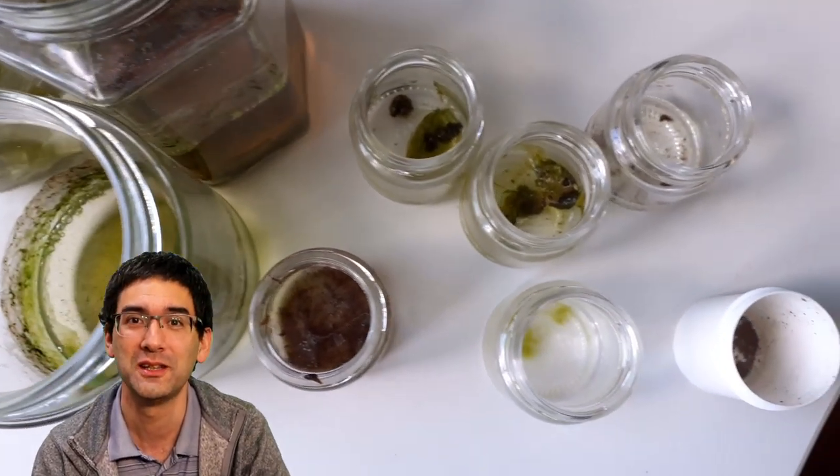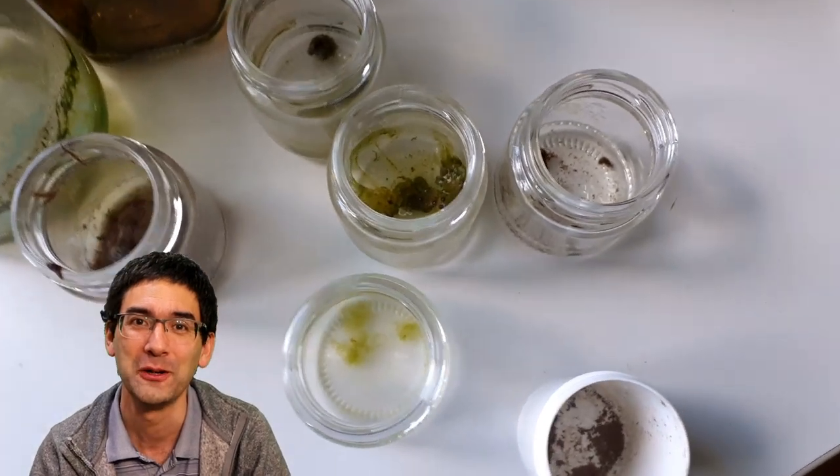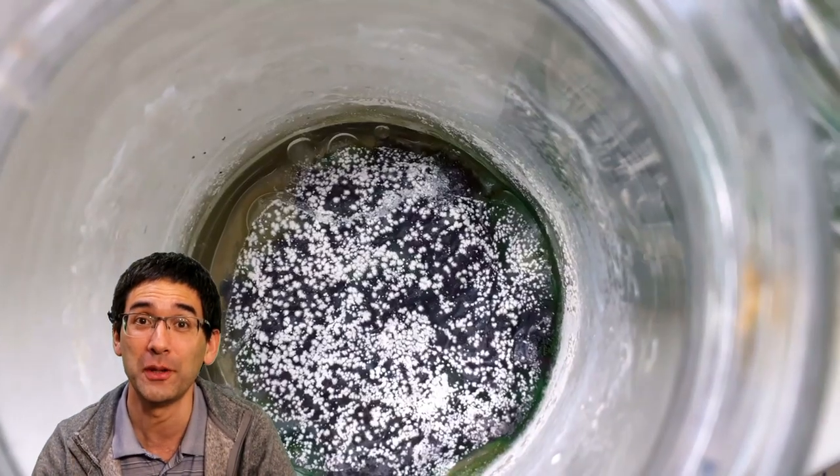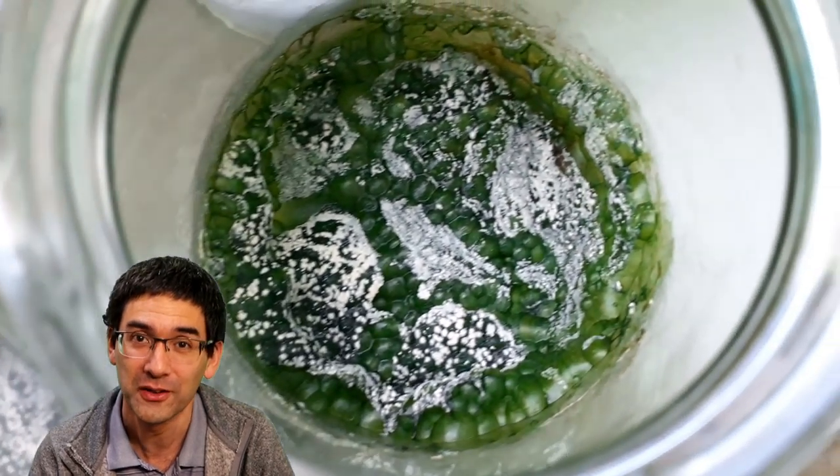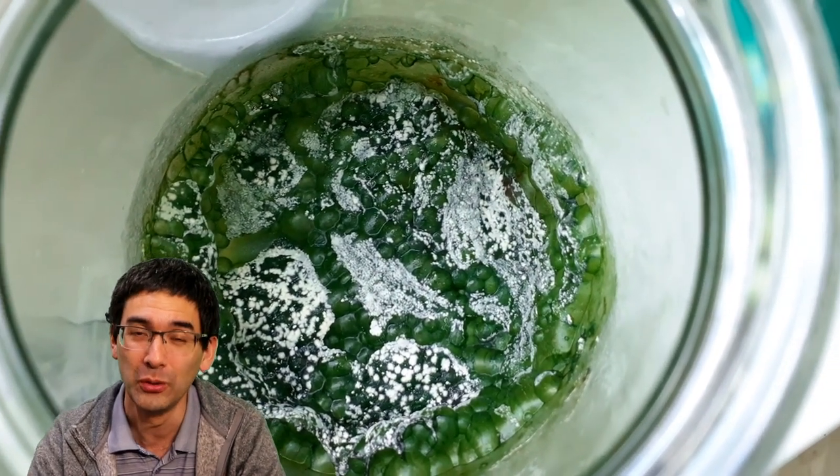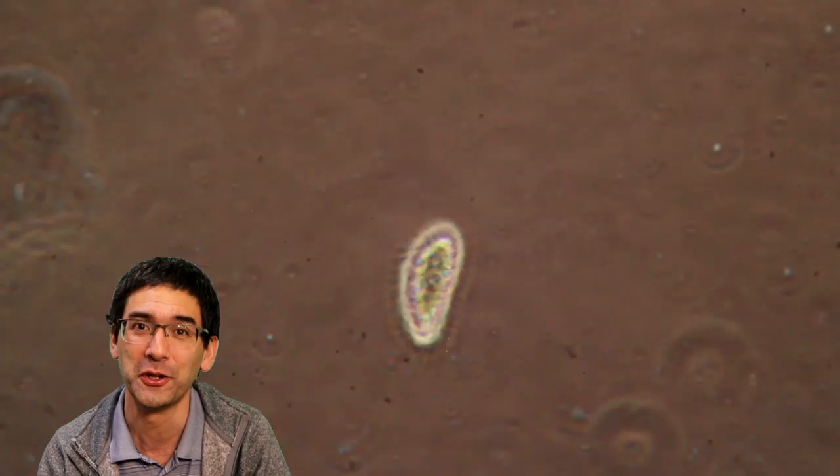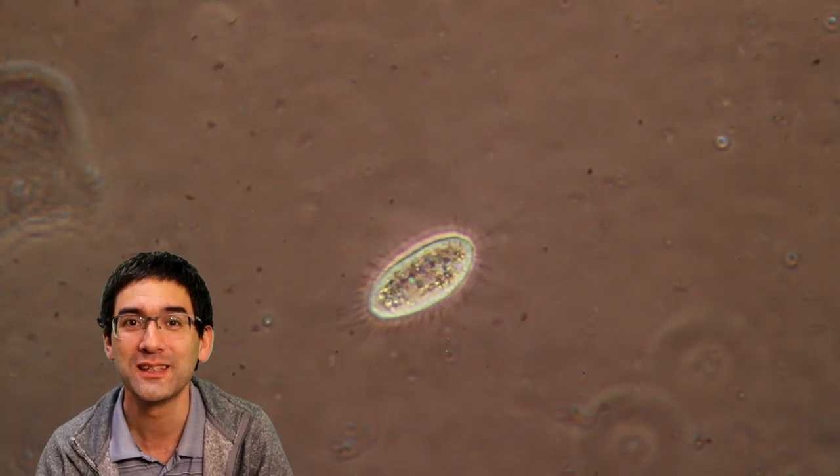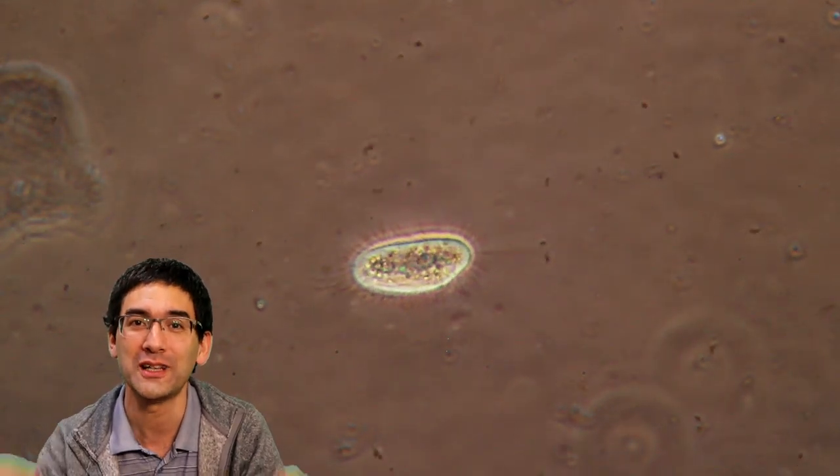You can see different types of jars and containers that I've been using here to grow it. That's also a possible result – there's a fungus growing on here; the whole thing started to get moldy and bad, also not very good. Here again, a nice ciliate moving around.